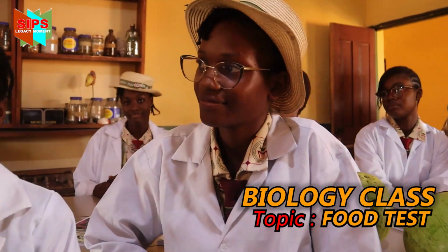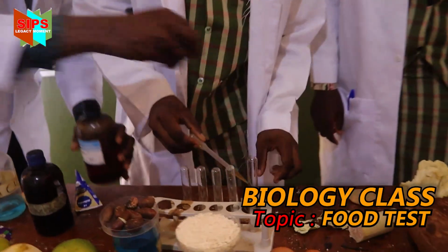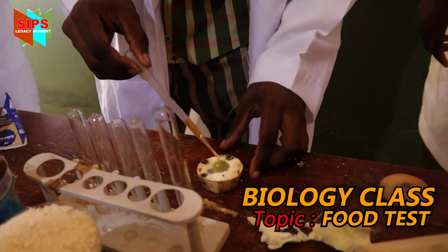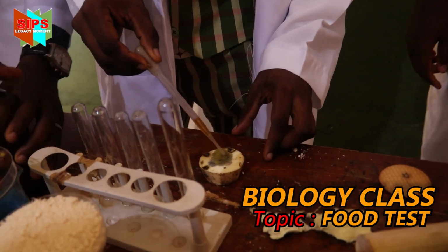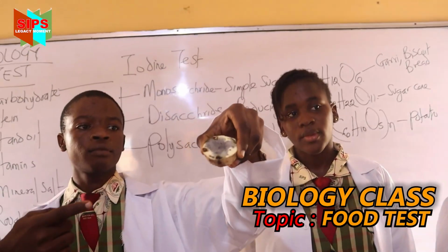Let's see whether there will be a change in potato. Please be fast. Remember, we must get an expected color change. There must be an expected color change. So you can show it to them. Show to them. What color? What are you seeing?